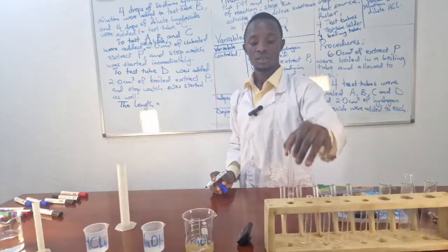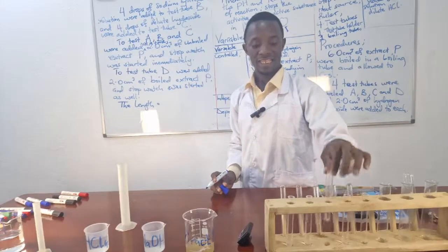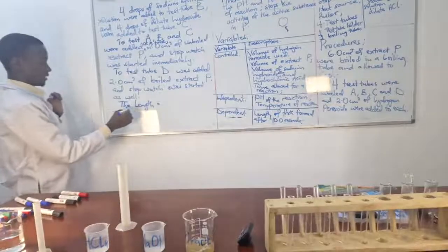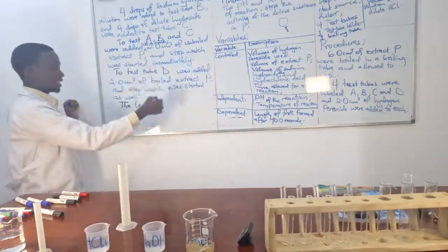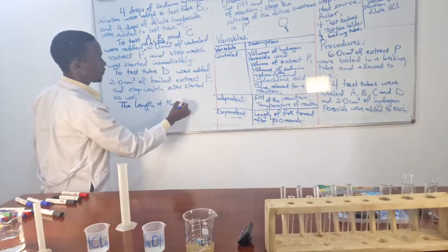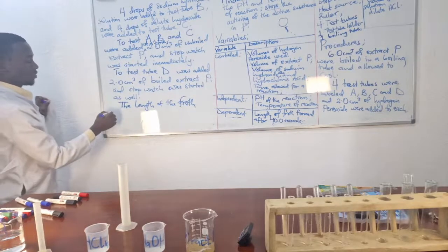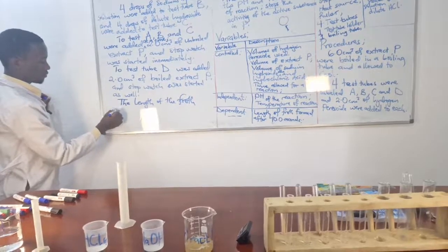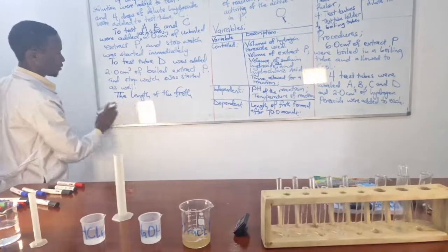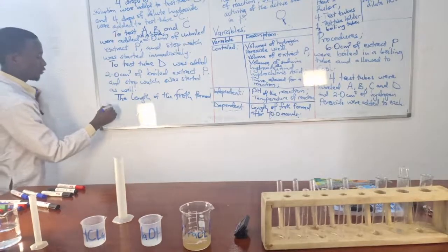When we handle this one, we shall be adding to this one later, to this one later, like that. To this one, after the time, the length of the froth was measured.